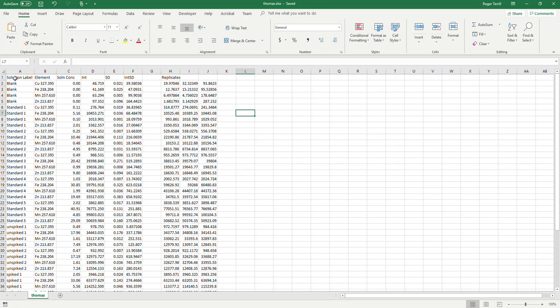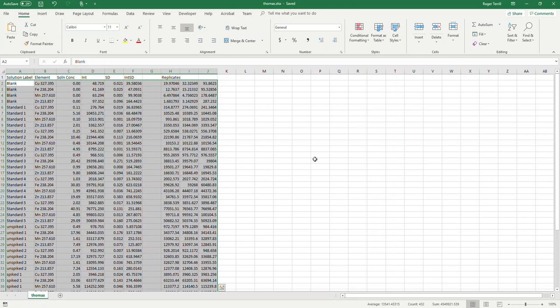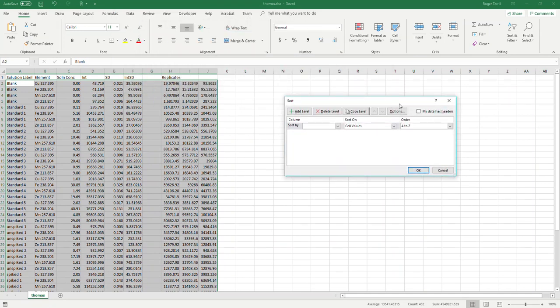So what we're going to do here is leave this heading row alone, and then we're going to highlight everything else. You go shift control arrow down there. That highlights everything, right? Now we're going to go up to here to auto sort and filter. And we're going to do a custom sort. Oops, my data does not have headers.